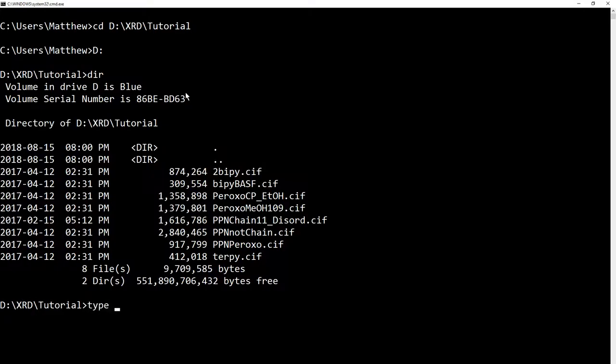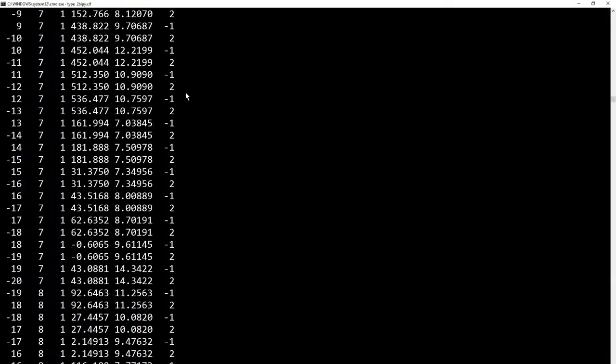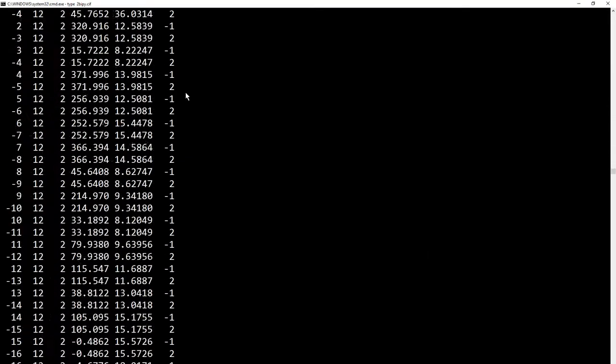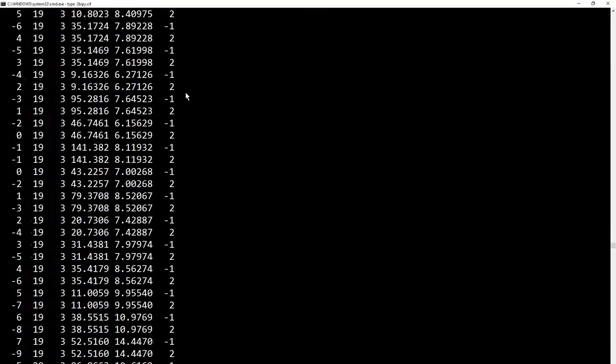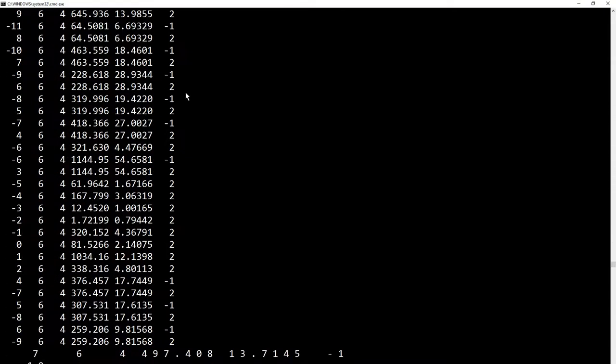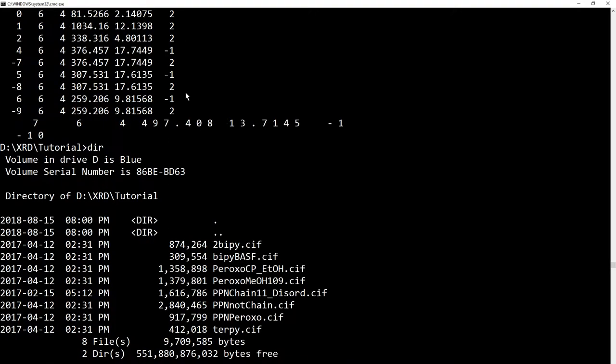So now, type types out the contents of these files. So if I go to bippy.cif, it's all displaying to screen now. It's not very useful, so I'm going to kill that by pressing ctrl-c, and show the directory again.